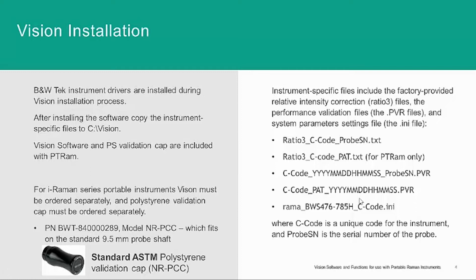The Vision software and the polystyrene validation cap for performance tests are included with the PT-RAM instruments. The cap must be ordered separately, as well as Vision software being ordered separately for the iRaman series portable Raman instruments.